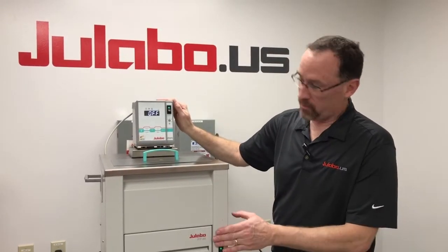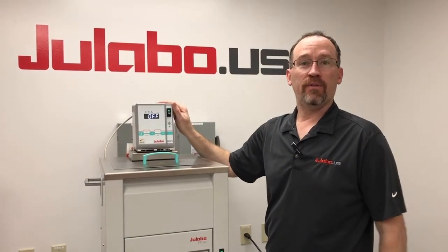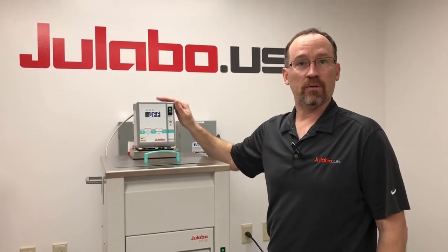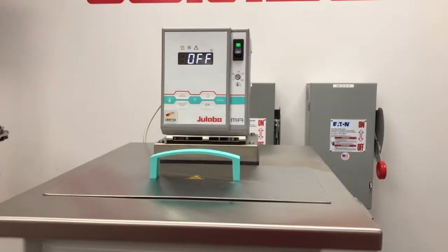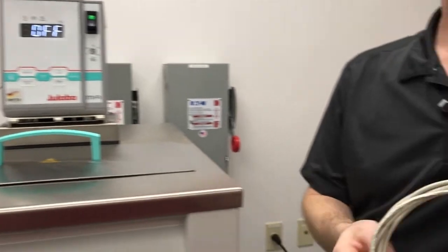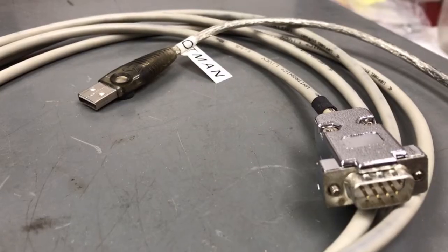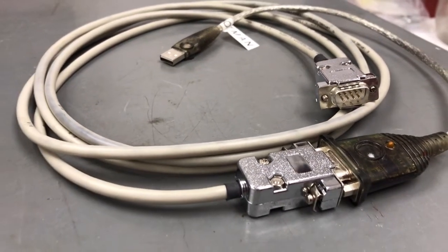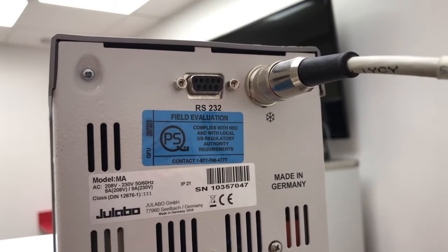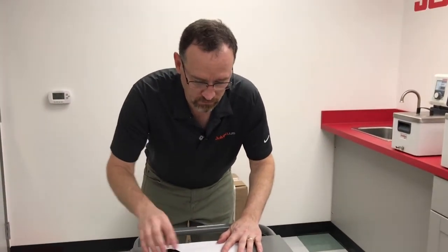First, we're demonstrating with an FP40MA, which the MA will simulate all of the previous units I've stated before for downloading Black Box. Make sure that the circulator head is in the off state. Next you'll need a modem cable, then proceed to connect the cable to the back of the circulator head, or in the front of the other devices where the RS-232 port is, and connect to your computer.